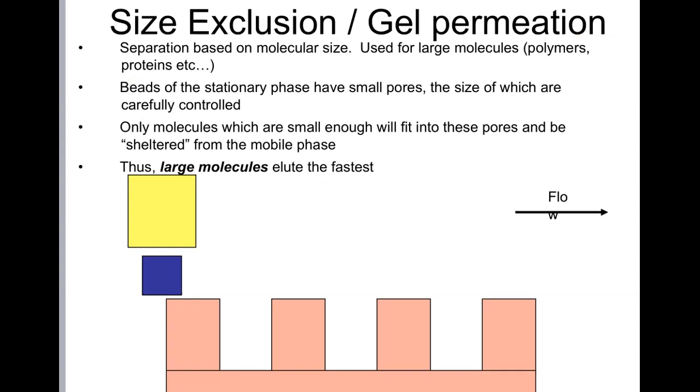Well, we're going to make a stationary phase out of a material that has very small pores, okay? Sometimes a model for that is like a little cone, sort of on the pore of a particle. Okay, so that's my little cone on a sphere. I have this weird cartoon picture at the bottom, but it's probably better to think of it as a cone. So basically there are these little pores, and they can be very, very small, like nanometer size, molecular size. And if a molecule comes along that is small enough, it can actually fit down inside that pore.